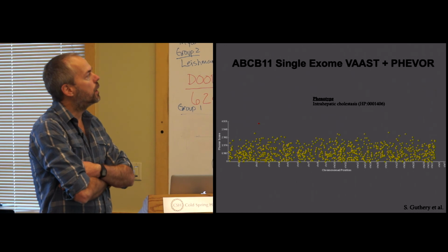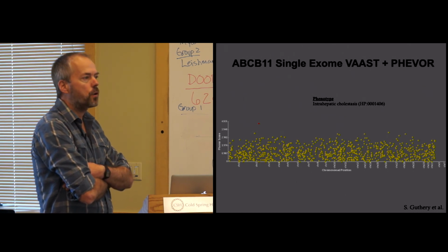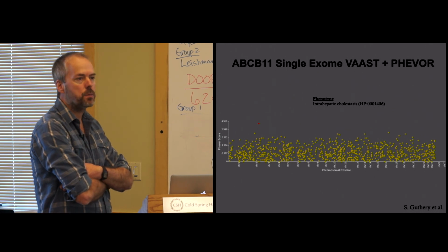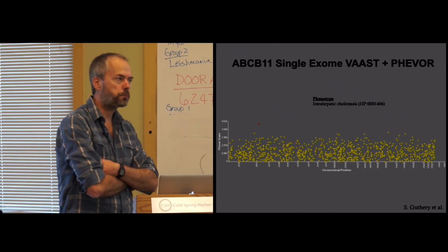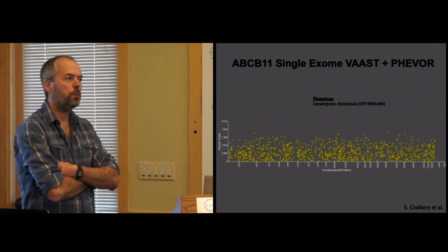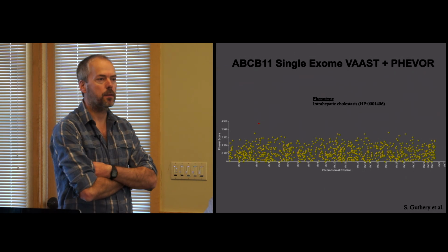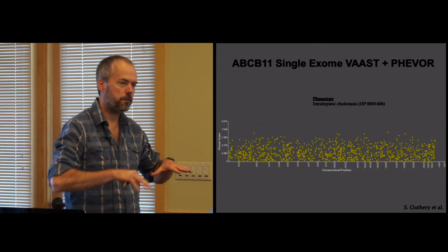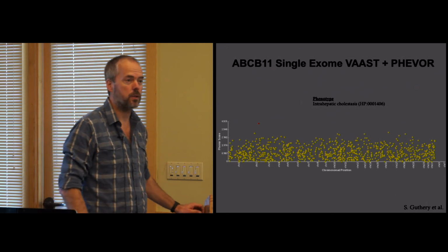So there's maybe a little bit of an art to figuring out what phenotypes to put in. In general, the more specific phenotypes you can put in, probably better. But sometimes people want to put in just every phenotype term that they can think of, and that can have the effect of lighting up so many parts of the ontology that you start to lose resolution.